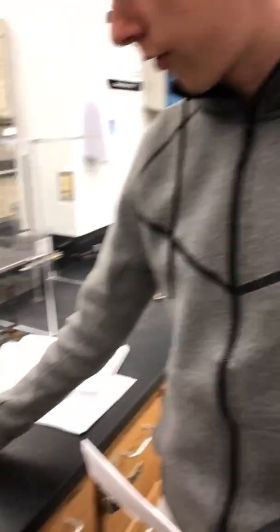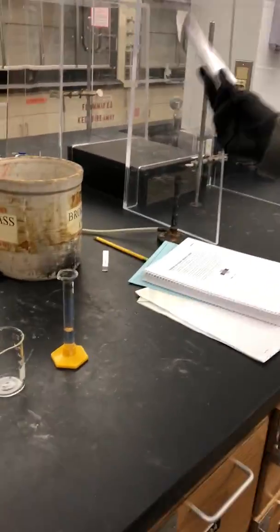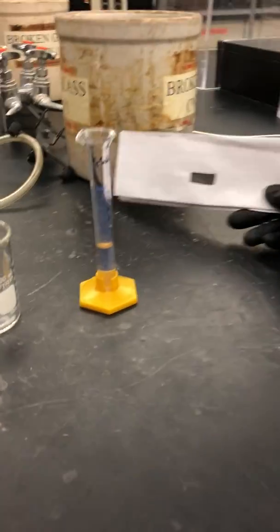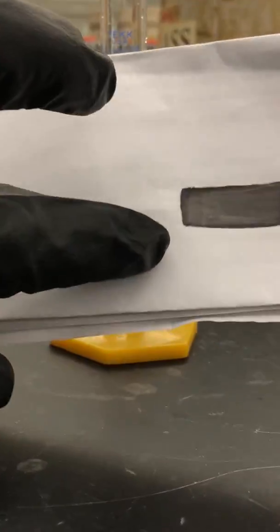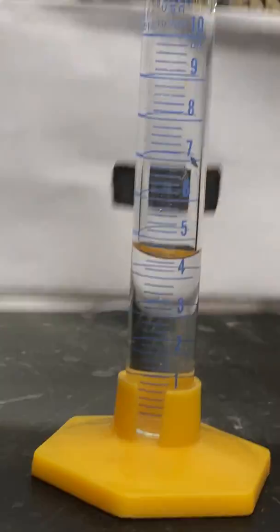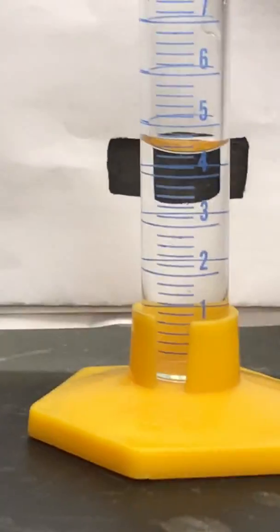Once you have your cylinder and your liquid, you're going to want to get down to eye level so you can get a better view, and then take a dark object and place it behind the graduated cylinder so you can clearly see the meniscus.